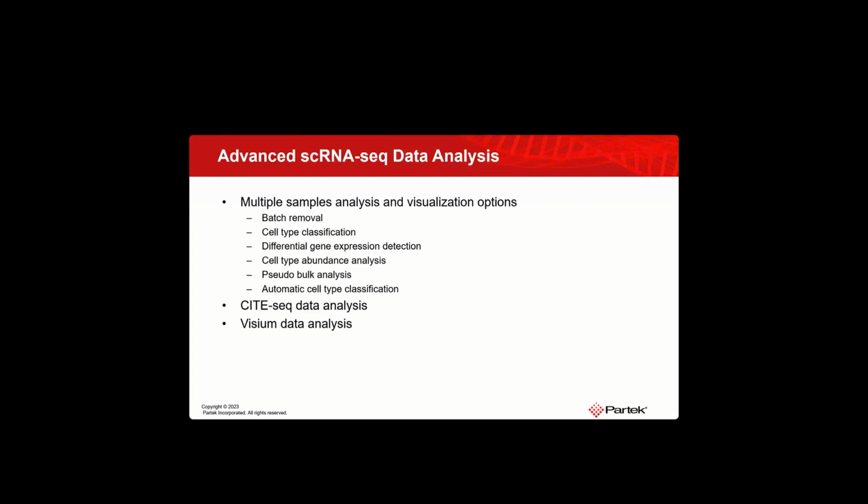Also, I will introduce how to do automatic cell type classification. Of course, this relies on a database, so you have restrictions on what kind of database you can find.